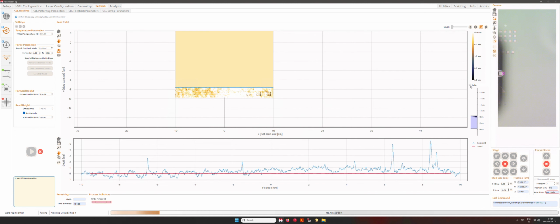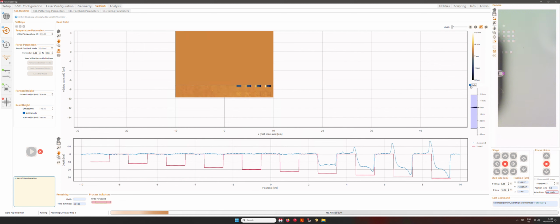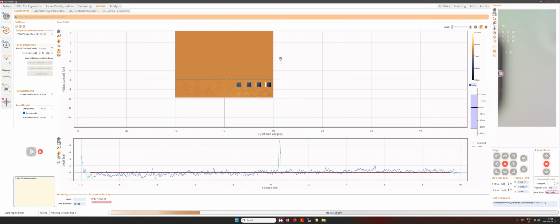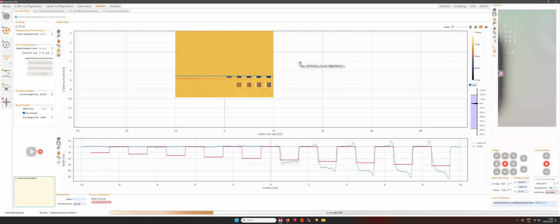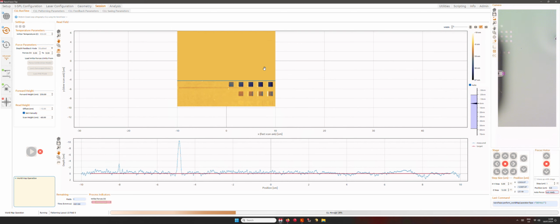But once you have done this process, we are already doing a temperature map, so we should already be good, as the purpose of the video is to show you how to use a temperature force map, maybe not to pattern a bilayer sample, but to pattern on new materials, especially. It's something that you can consider, let's say, if you want to change the properties of materials or induce some phase changes or any other interesting applications that you have in mind.